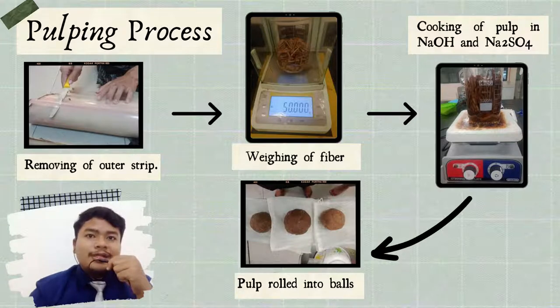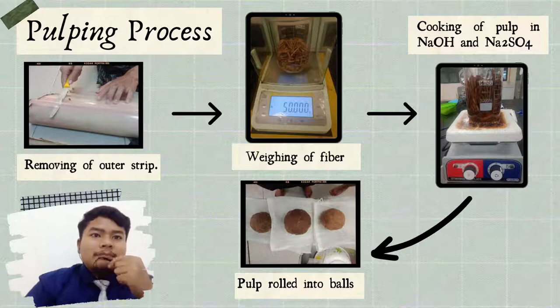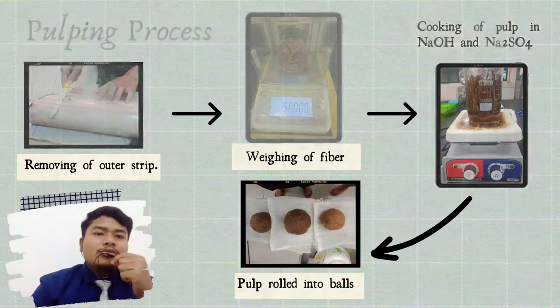The fiber was blended so as to achieve a lovely consistency. The pulp was rinsed to remove NaOH and Na2SO4. Finally, the excess water was squeezed out and the pulp rolled into a ball.